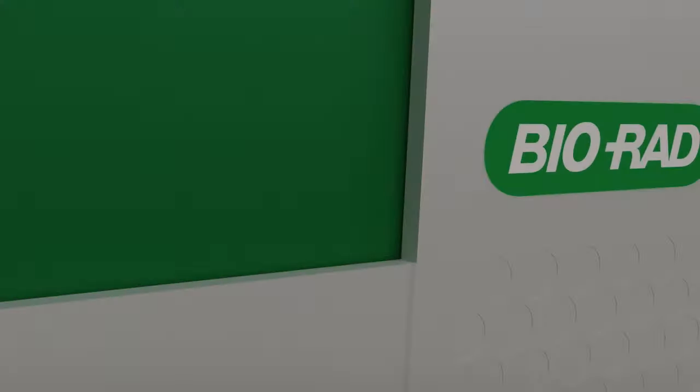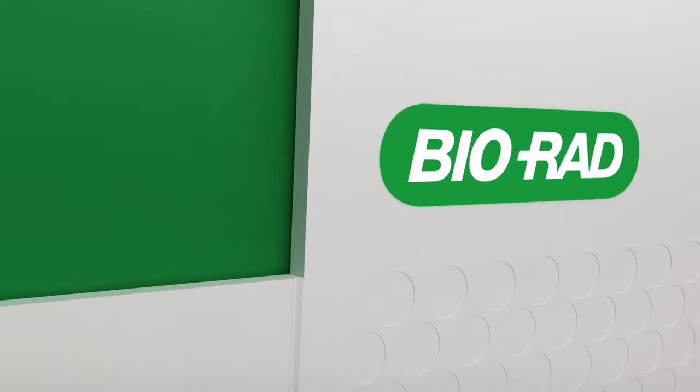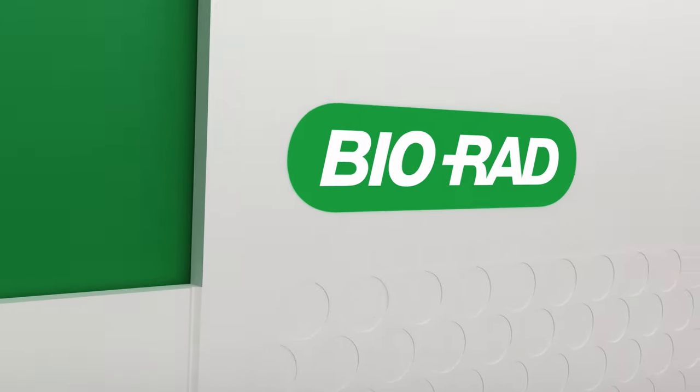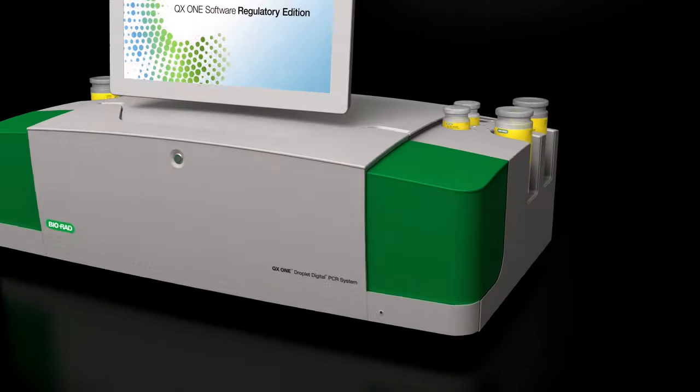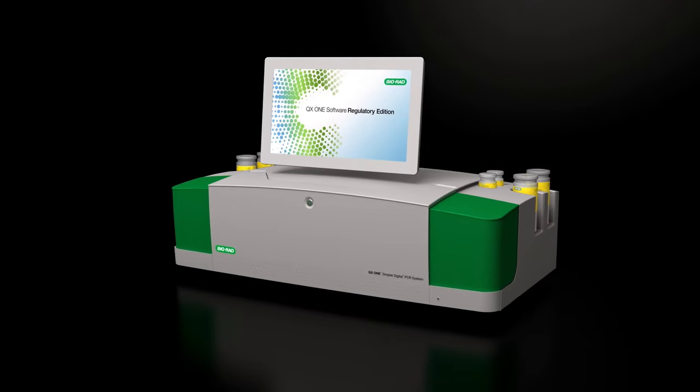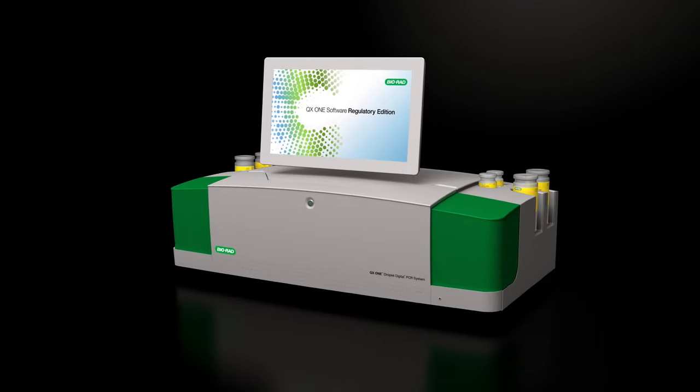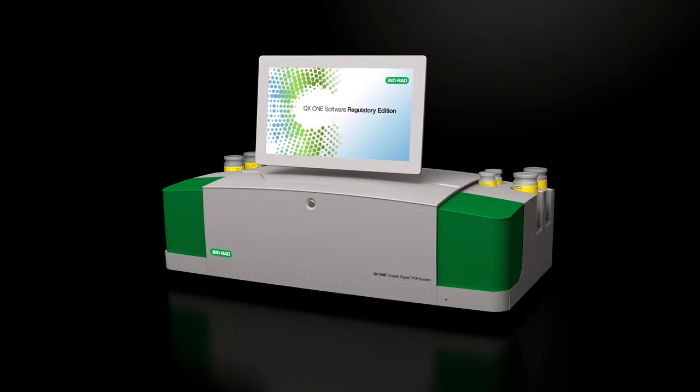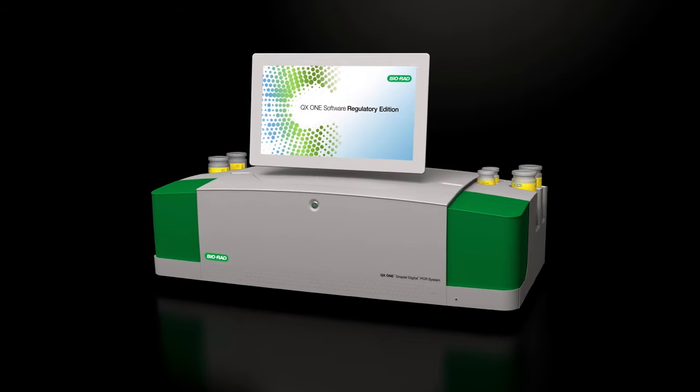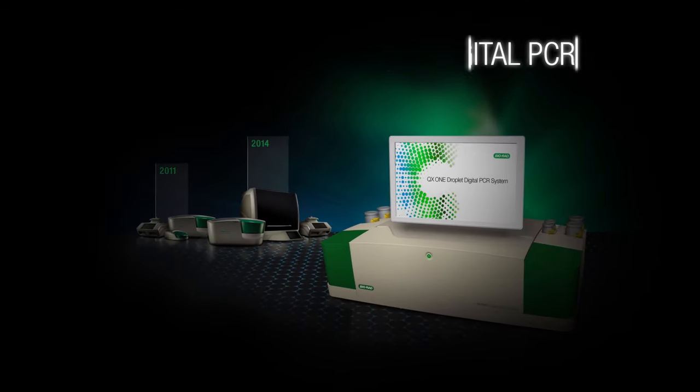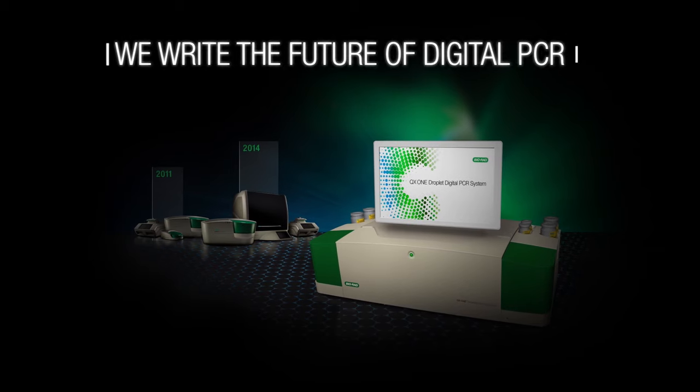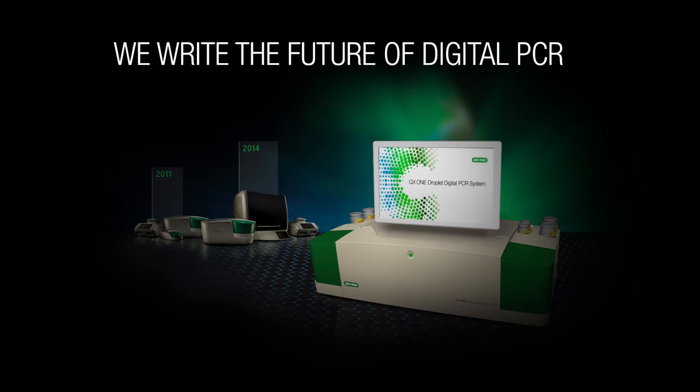Brought to you by BioRad, the world's leader in digital PCR. From preparing reactions to reading droplets, the QX1 is the all-in-one integrated system that will change how you do digital PCR.